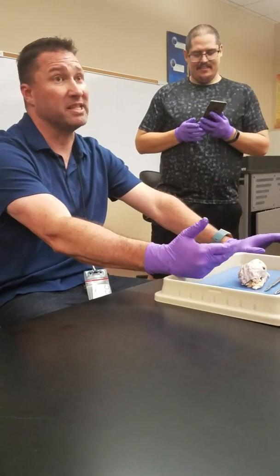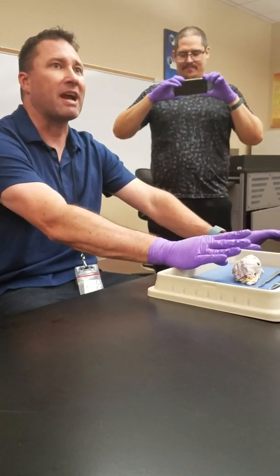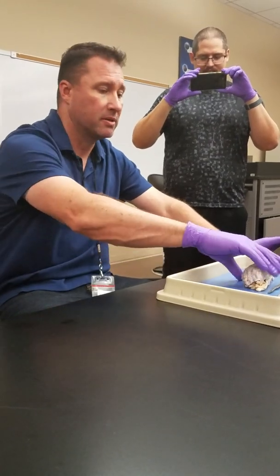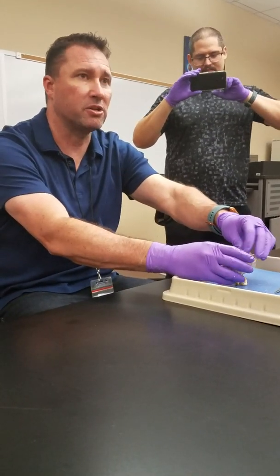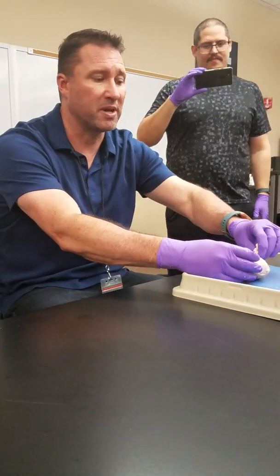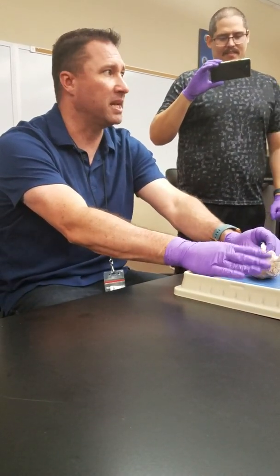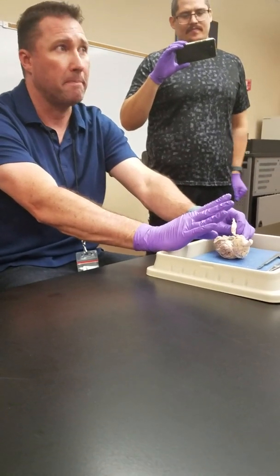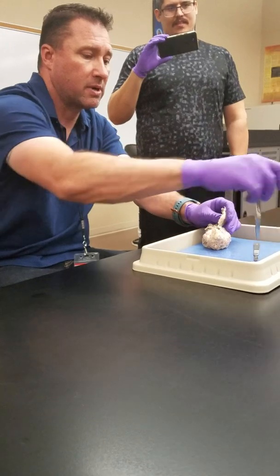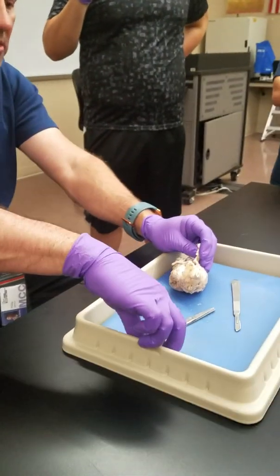Arachnoid mater, which means spider mother, and then directly attached to the brain is what's called the pia mater, or delicate mother. So here, this tough connective tissue you see around it, that is the dura mater, which means tough mother. Inflammation of these meninges is called meningitis. That's what meningitis is.